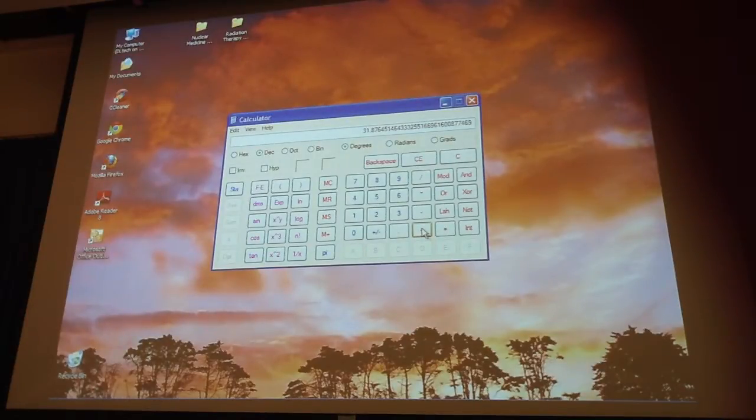Is that the plus? Yeah, that's a plus. Okay, 49.2. So 81 millicuries, is that what you got, roughly?